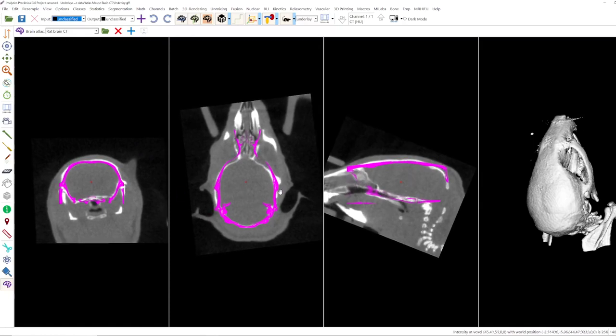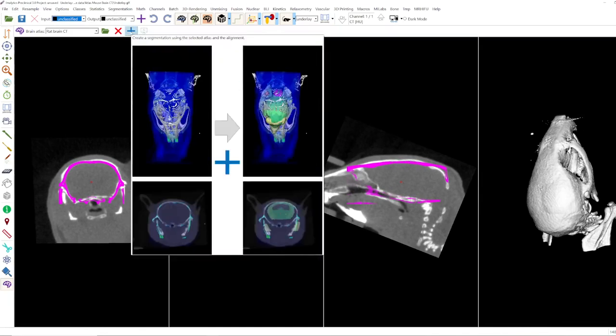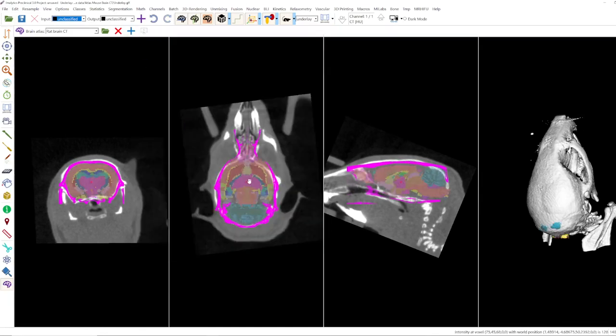And then you can go to the plus here, the blue plus and it creates a brain segmentation.